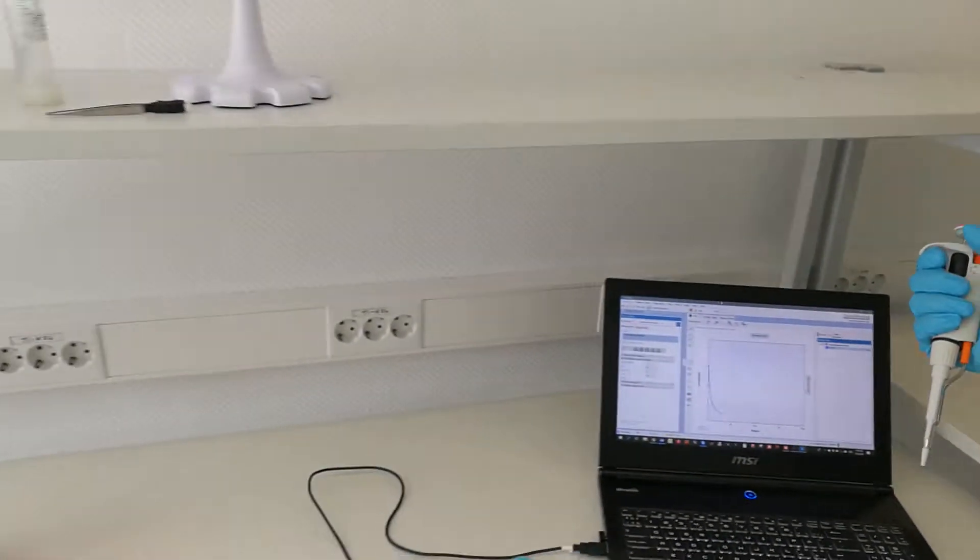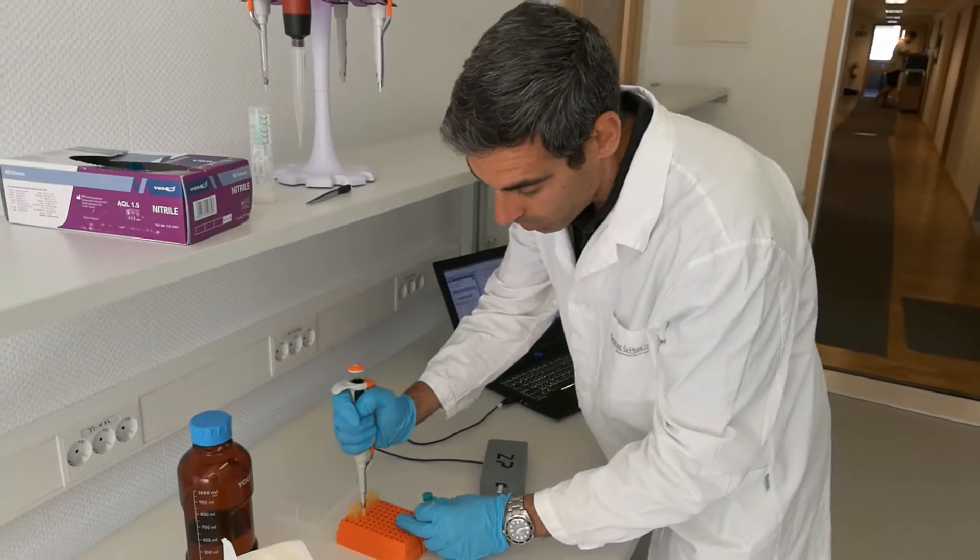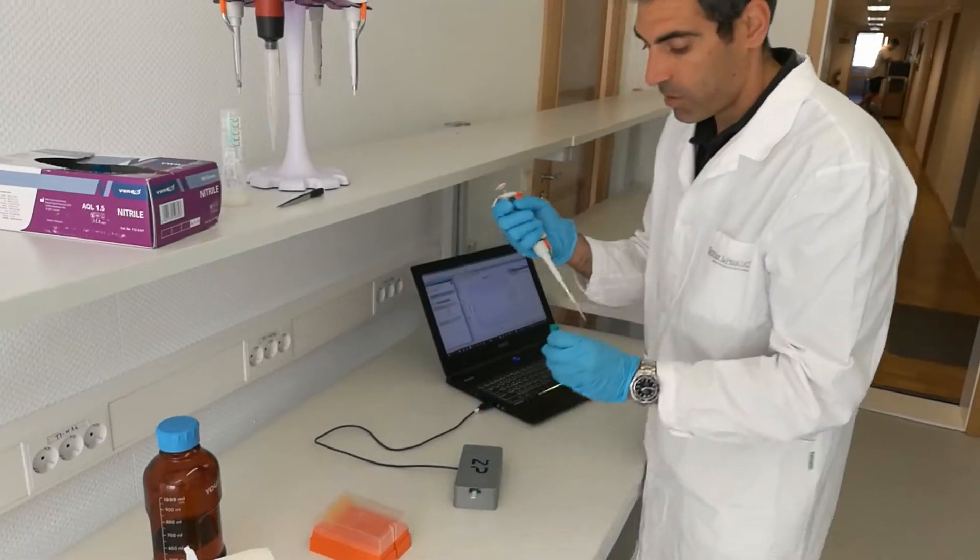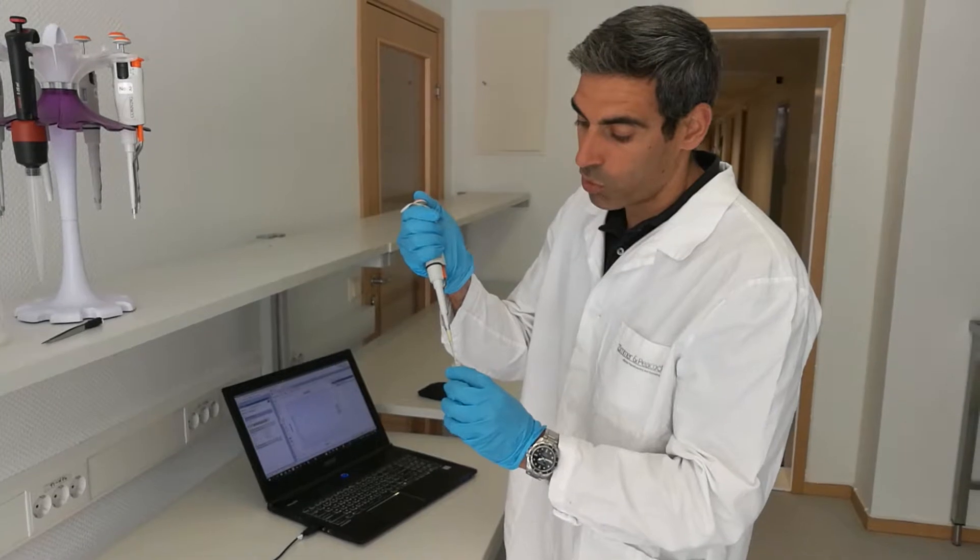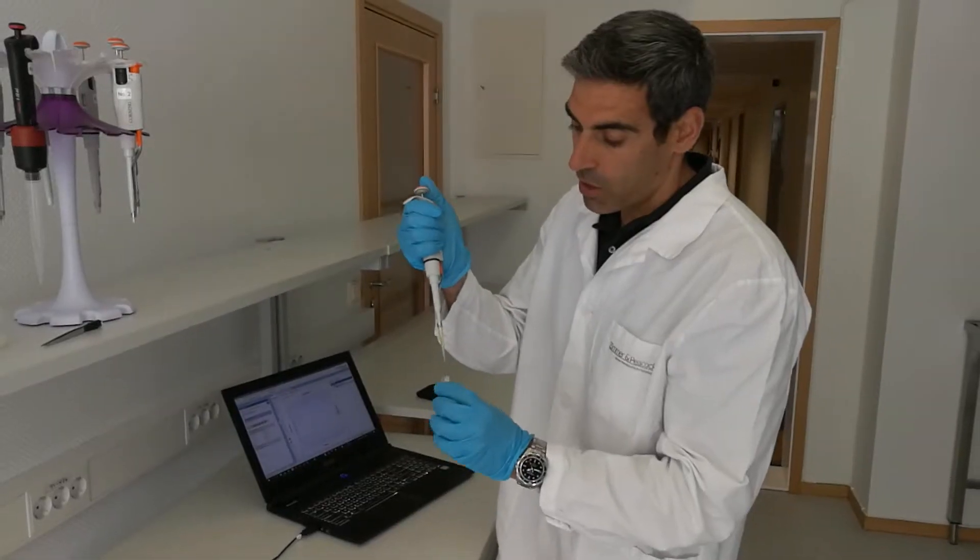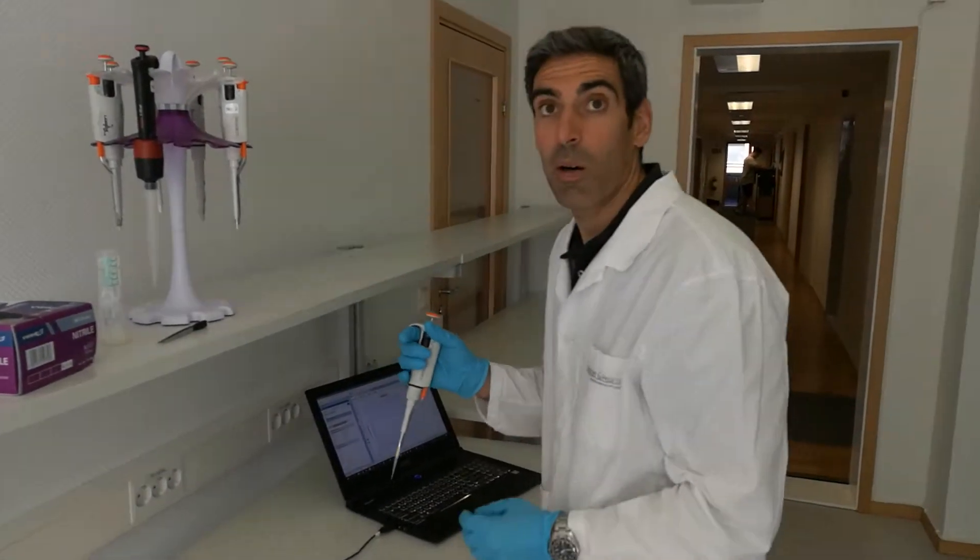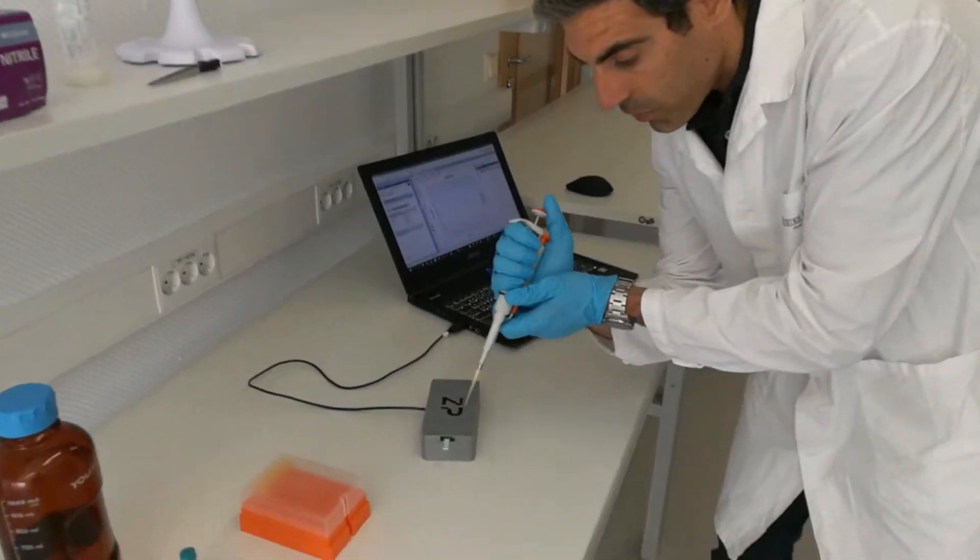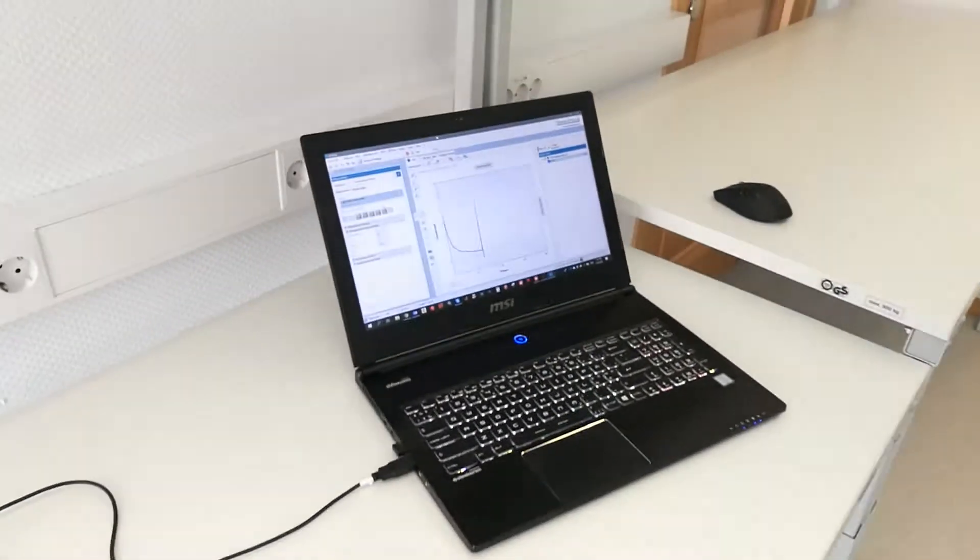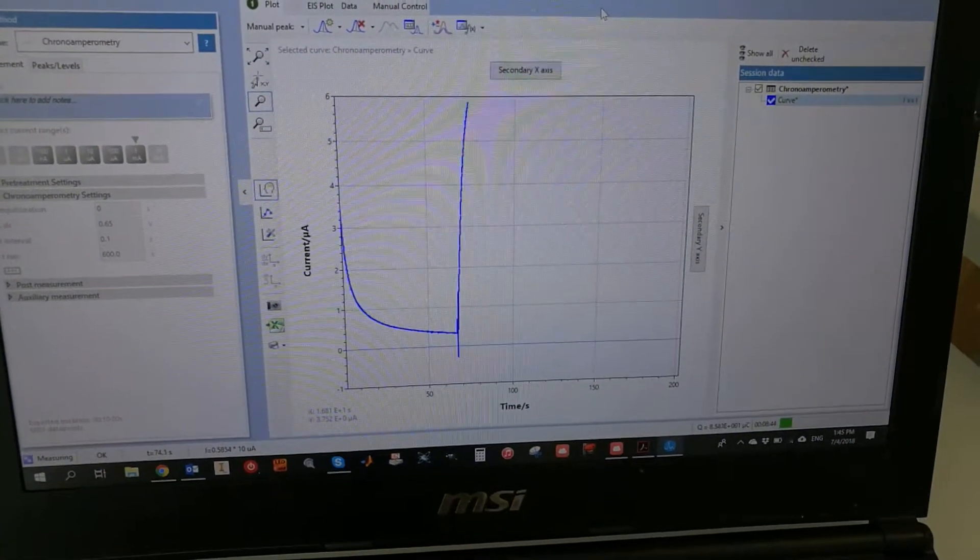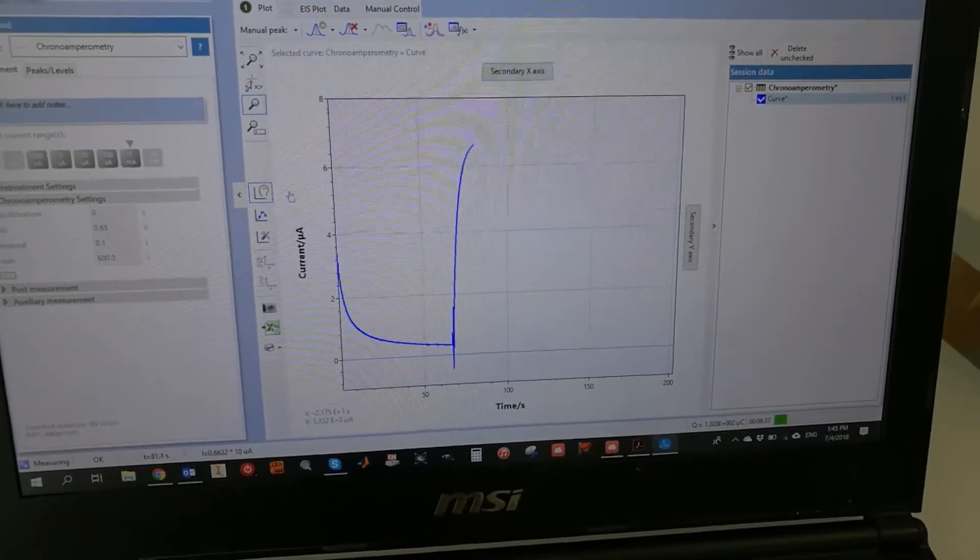I'm going to add one molar glucose concentration. I'm not looking to achieve a determined concentration, I just want to show a response to glucose. So I'm going to drop around 10 microliters. You can see a big response. This is probably over 20 millimolar step, but you can see a big response to glucose and then acquiring a new baseline.